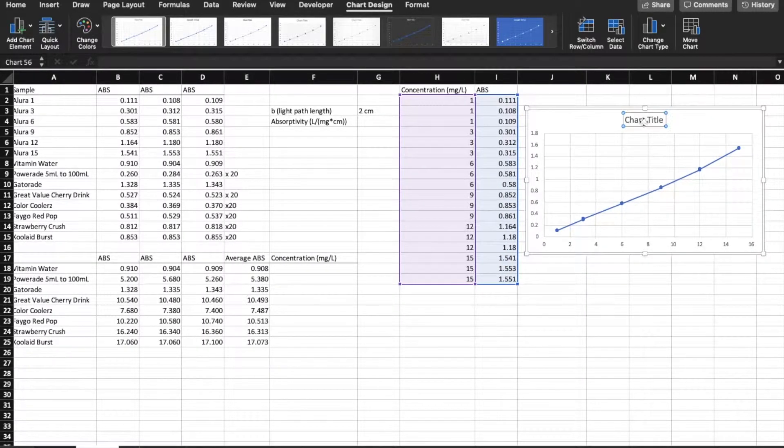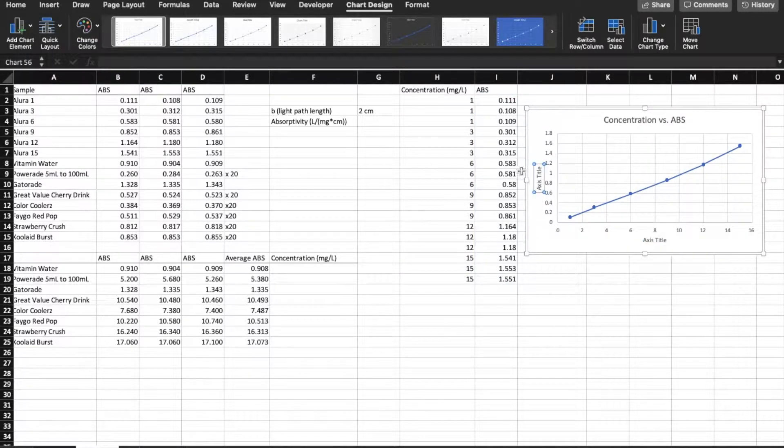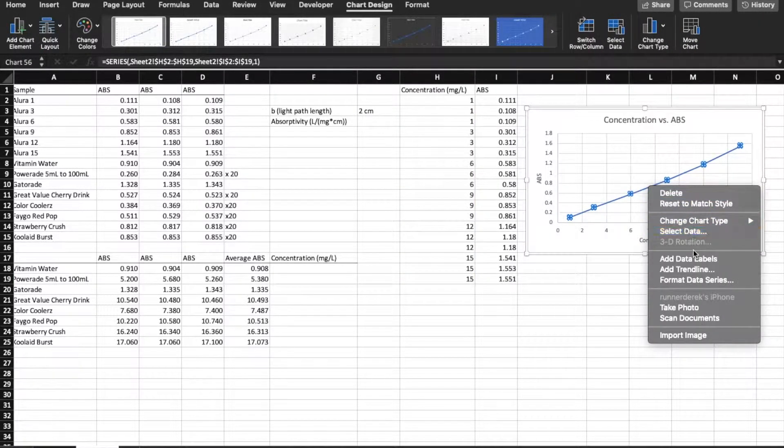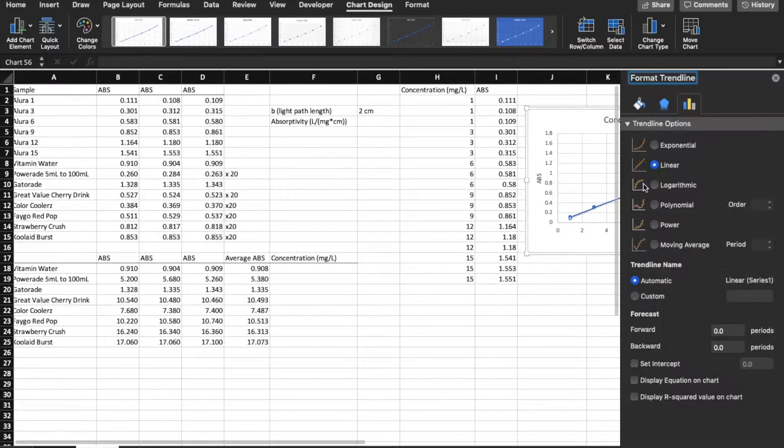This is going to be concentration versus absorbance. So we're going to have concentration on the x-axis and absorbance on the y-axis. I'm going to add the axis titles and change those to what they are supposed to be. I'm going to go ahead and click on the data. I'm going to add a trend line. That's at the right click. Click add trend line.